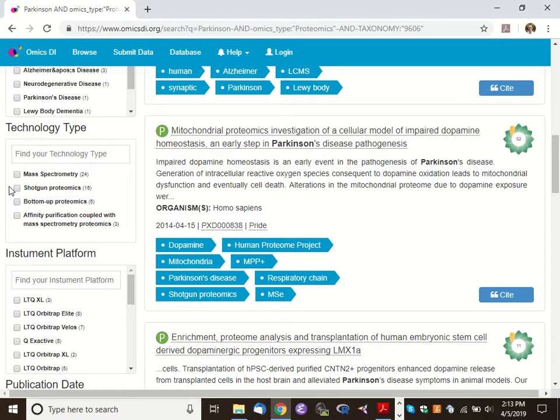We also see people have used the term bottom-up proteomics. Now, you may remember that I spoke this morning about top-down proteomics being a type of proteomic experiment where we do not digest the protein before it enters the mass spec. So, in contrast to this top-down model, where you look at the protein as an intact molecule, people often speak of a proteomics where you identify peptides and from them infer proteins as bottom-up proteomics. So, bottom-up proteomics and shotguns and data-dependent acquisition proteomics, these are all synonyms for the same thing.